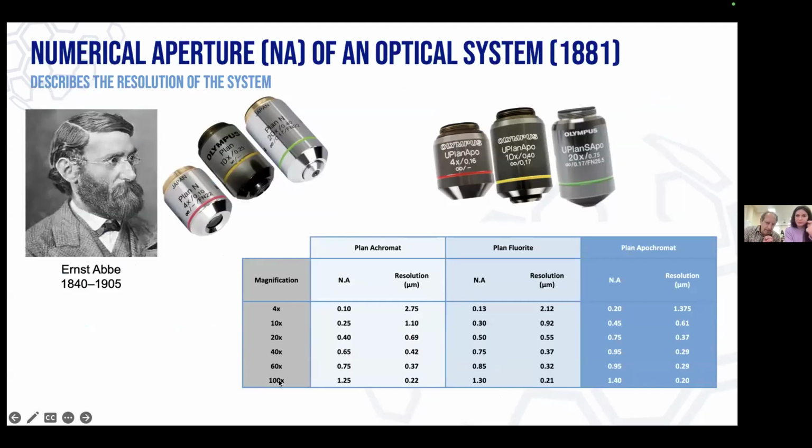So this is magnification, but you see as the magnification changes, the numerical aperture changes and becomes bigger. And this is the resolution of 2 points. It almost doubles for many lenses until it flattens. So there is very little difference between times 40 and times 60. People notice that at times 60, the image is much more fuzzy.